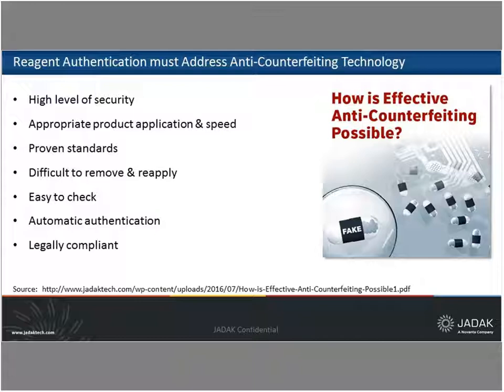You should use proven standards that conform to common standards that are used worldwide. And by that, I mean stay away from proprietary technology. What this does is kind of paint you into a corner, and if the technology goes obsolete, you're left holding the bag. So just make sure that you choose a technology that is used worldwide, and there are standards associated with it. Ideally, you want to use a technology that someone attempting to counterfeit it might not even know that it's there.